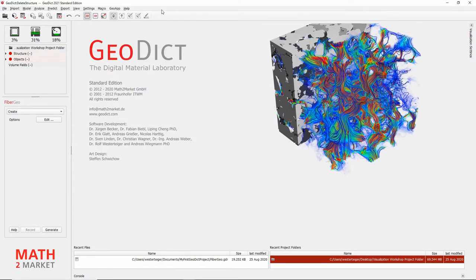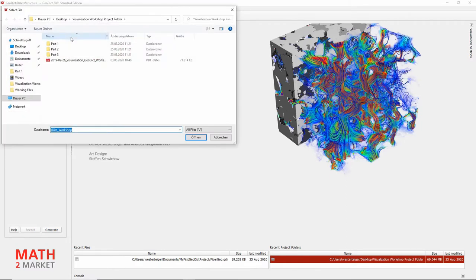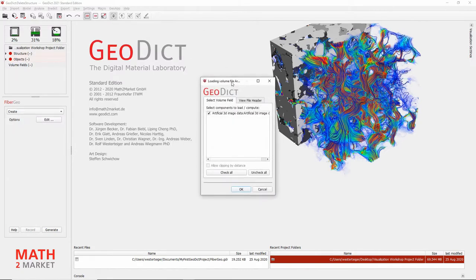Now, the first thing I would like you to do is import a so-called GRW file. A GRW file is a GeoDict raw file which can contain 8, 16, or 32-bit gray value image data. In order to load this example file, please click File, Load Volume Field. Navigate to the Part 1 subfolder of your project folder, and then double-click the file called Artificial3DImagedata.grw. In the upcoming dialog, please click OK.